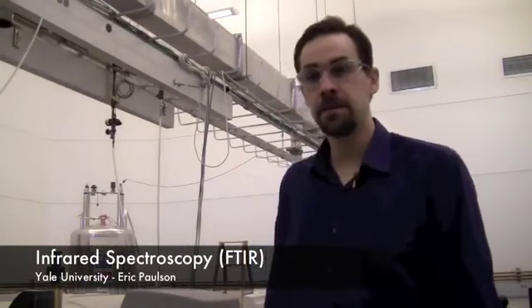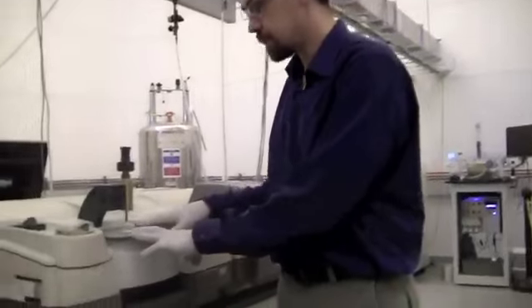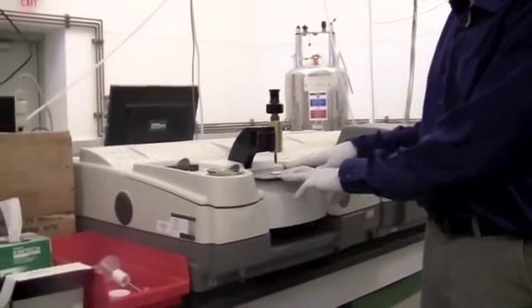This is an explanation of how to use the FTIR with the Smart Orbit Diamond ATR cell. Changing of the Diamond ATR cell, if it's not in there, will be covered in another procedure. So when you come to the instrument, it should already be set up with the Smart Orbit in place.